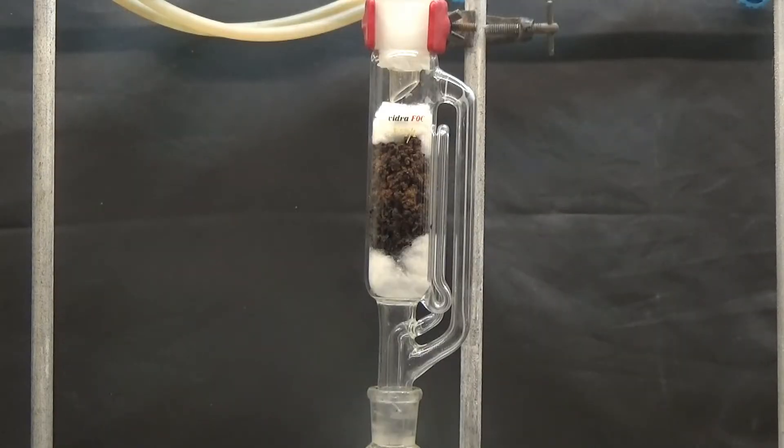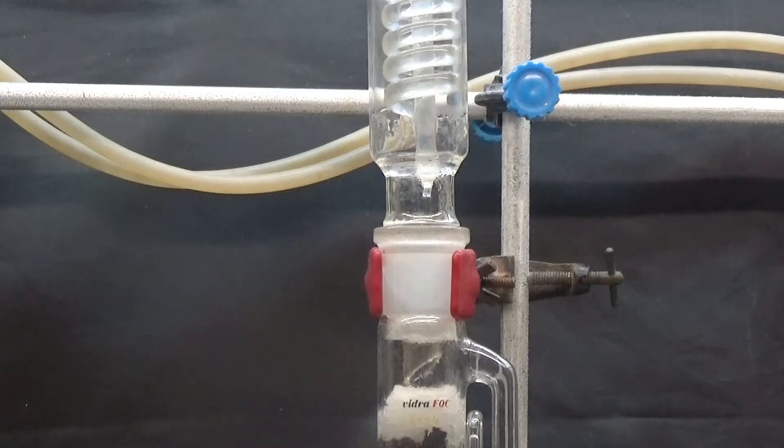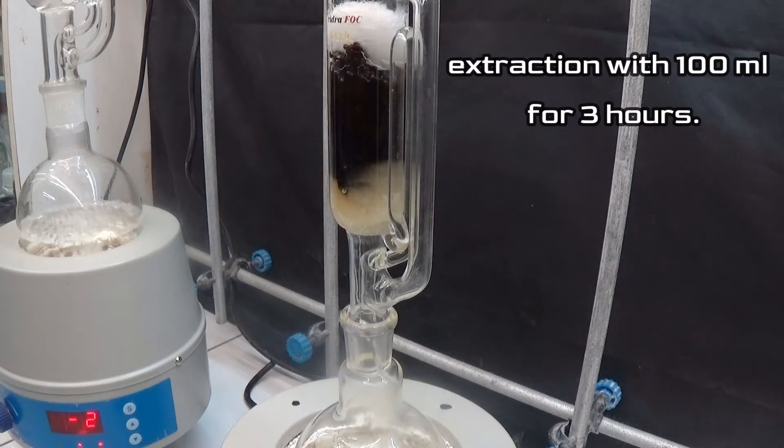The residue from the filter funnel and capsule is put into a Soxhlet extractor. The solid has been subjected to extraction with 100 milliliters of toluene for 3 hours.